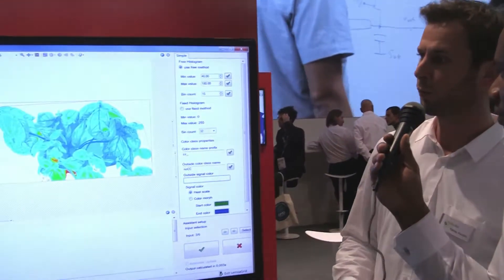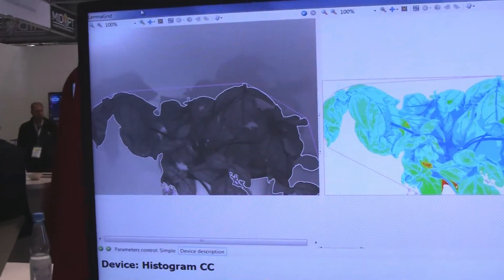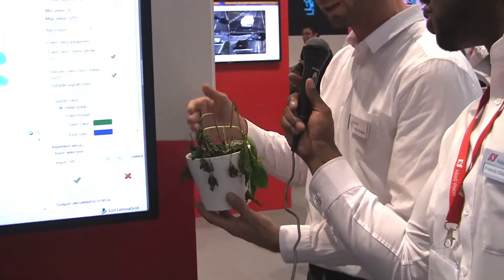And I hear you're going to demonstrate a little bit about how you put the plant in your system. Yes, so this example shows the use of the shortwave infrared camera to detect water content inside plants. Inside we have an illumination, we place some plants inside — for example, this dried out plant, it looks not very healthy anymore.